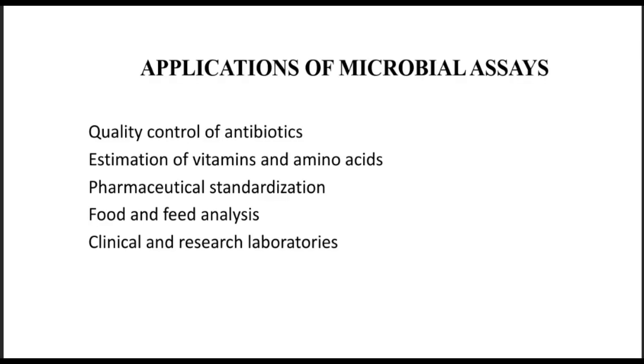Application of microbial assays. Quality control of antibiotics, estimation of vitamin and amino acid, pharmaceutical standardization, food and feed analysis, clinical and research laboratories.